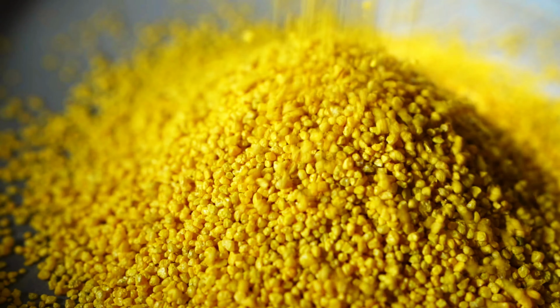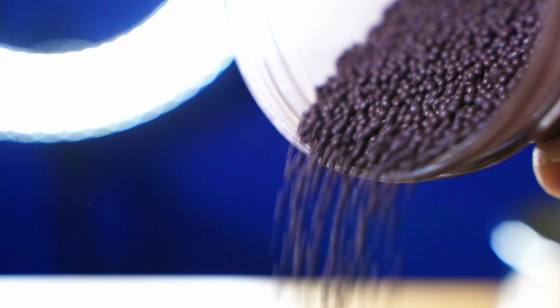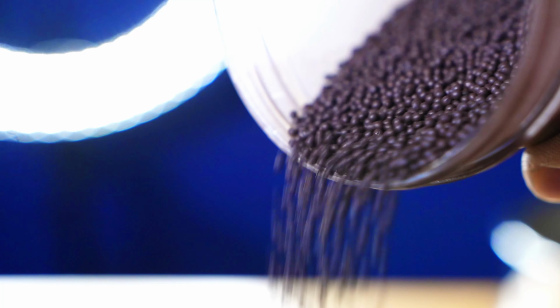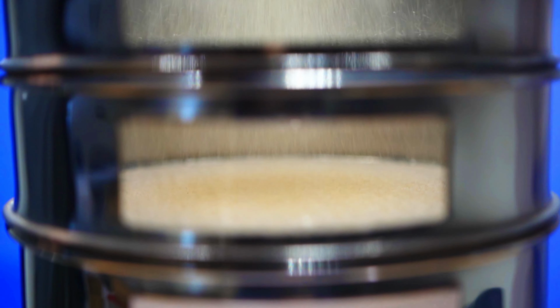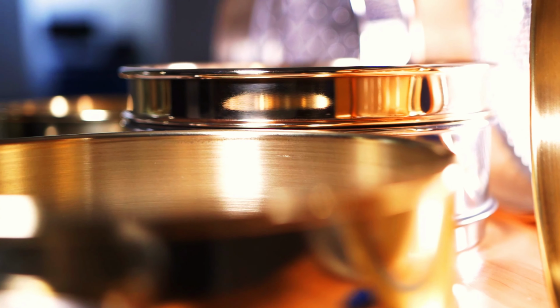There are cases where research and development teams work with material that standards haven't been determined for yet. If the general size of the particles is known, having a mix of ASTM E11 standard test sieves above and below the nominal size can help determine the efficiency of your production process. Once a mix of particles is determined to perform as desired, future production can be quality checked using sieves to check ongoing particle size distribution. Typically, we suggest going to the standards website like ASTM or ISO and searching for similar material to yours. This can offer some insight into testing methods and processes.